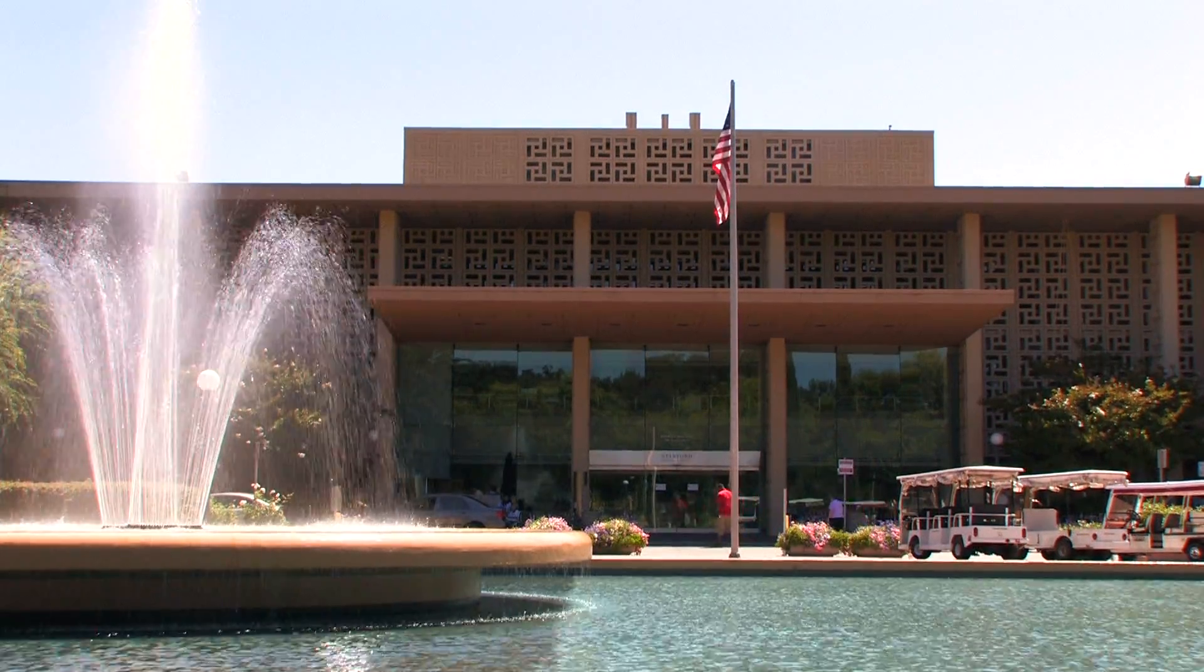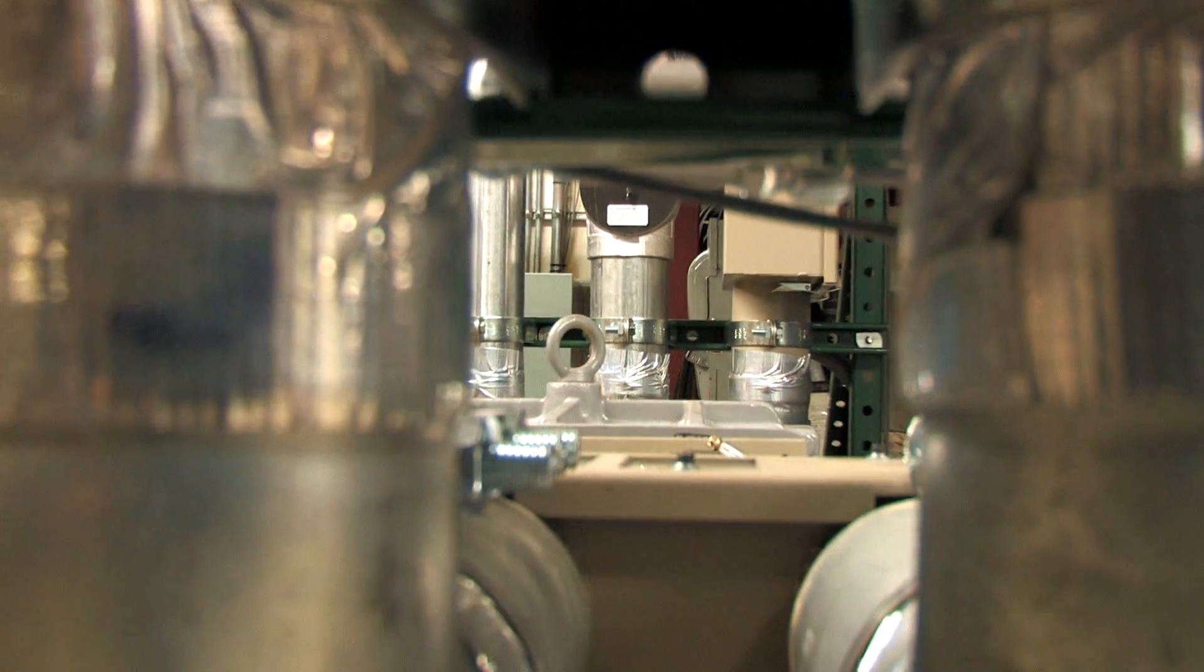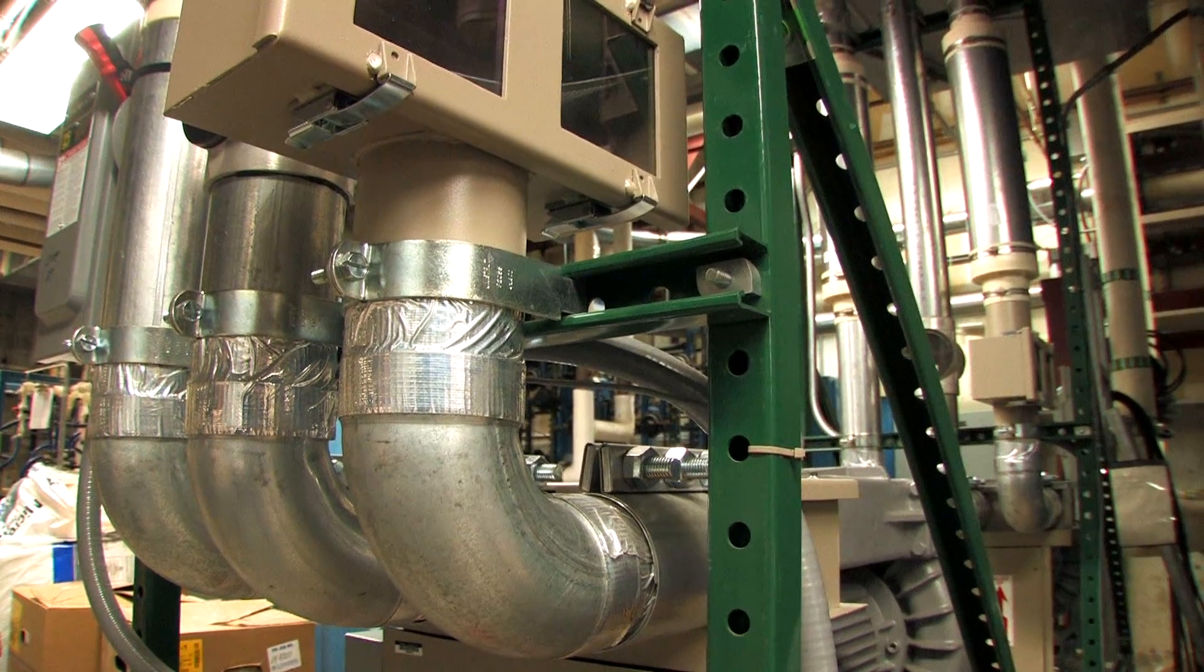We installed the pneumatic tube system back in 91. There's about four miles of pneumatic tube in the system, and if you calculate how many people it would take to hand carry those products, it would be a lot more than the few people I have to manage the system.